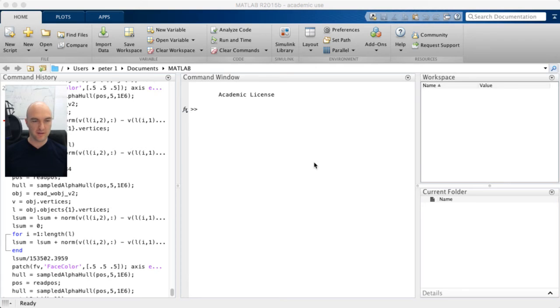I teach a little bit of atom probe data analysis through YouTube videos and live streaming, and this was mostly done with my research group. I'm a W1 professor, which is kind of like an assistant professor here in Germany, and I'm running an atom probe group. Of course, I'm trying to teach my PhD students and also master students how to use the atom probe and how to do proper data analysis.